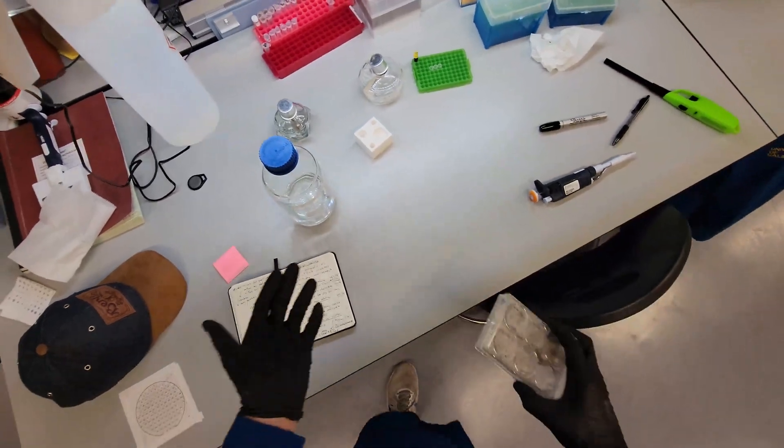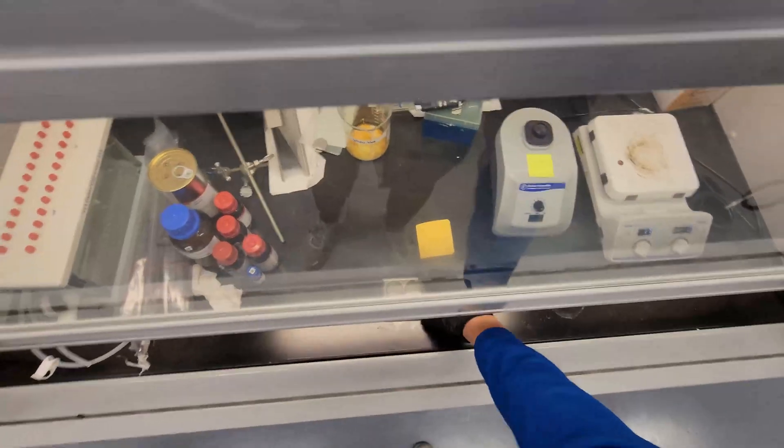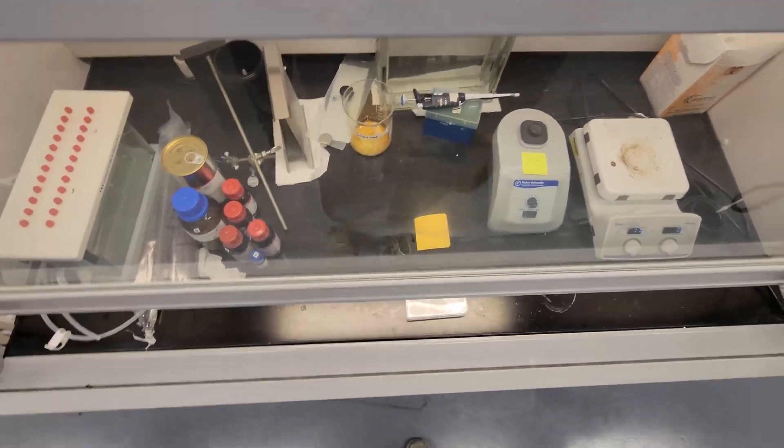But basically, first, this is going to be a speed run because I want to get this done. But hopefully you can see through the fume hood. We're working with chloroform, so we want to have our gloves and lab coat on and work in the hood.